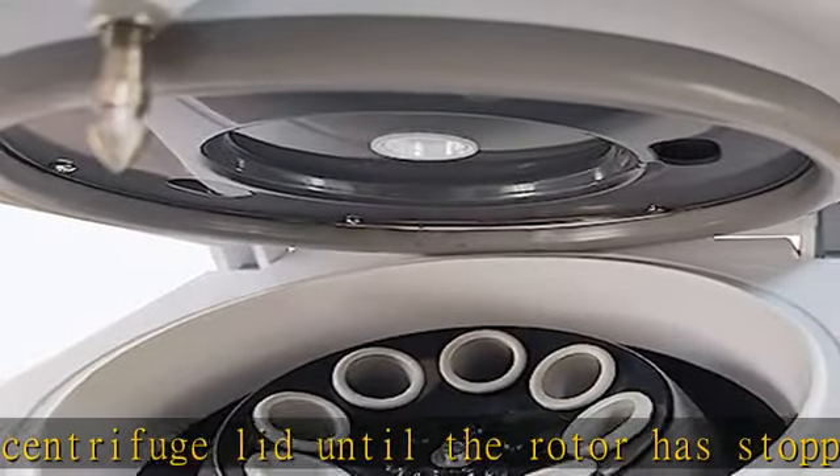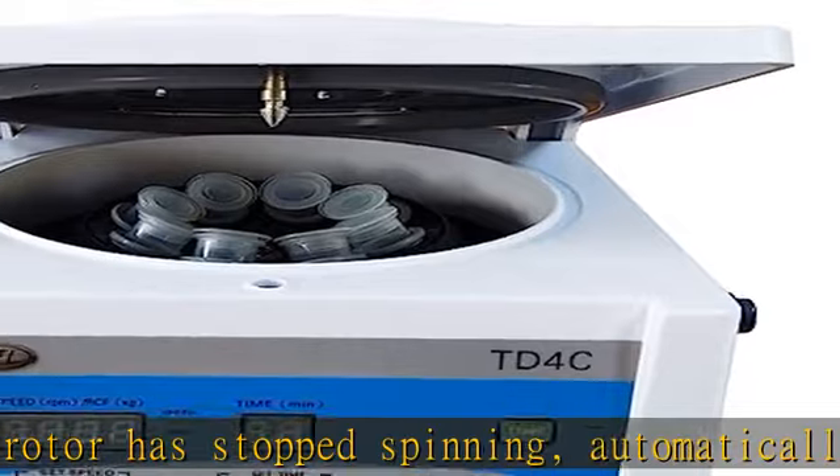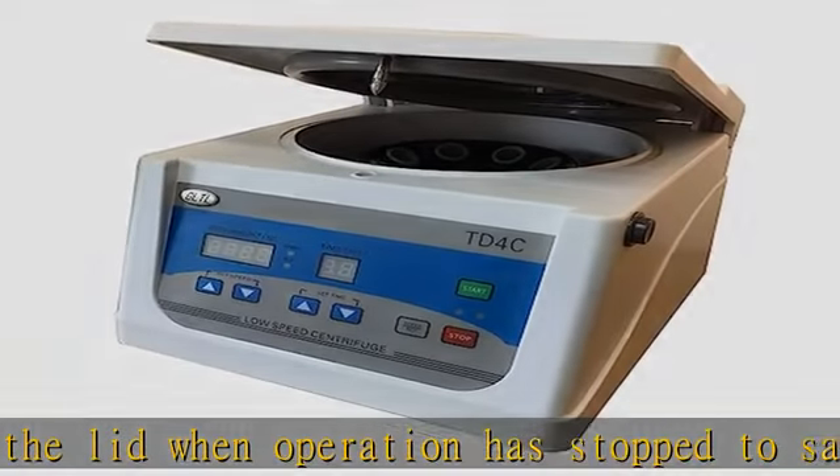the TD4C is the ideal choice for medical, scientific, clinical, and industrial applications, and is backed by our comprehensive one-year warranty against manufacturer's defects.